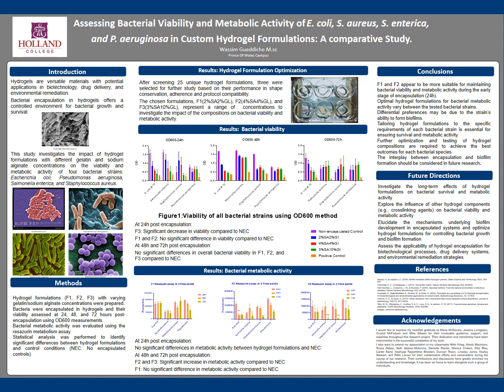number of bacterial cells, and then assessed their metabolic activity using a resazurin metabolism test, which is a second and indirect outcome measure consisting of detecting the fluorescence of the resorufin product after metabolization over time. These tests were conducted at 3 different time points, 24, 48, and 72 hours post-encapsulation.